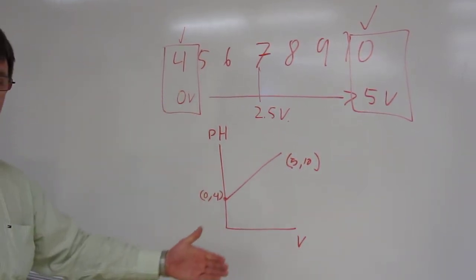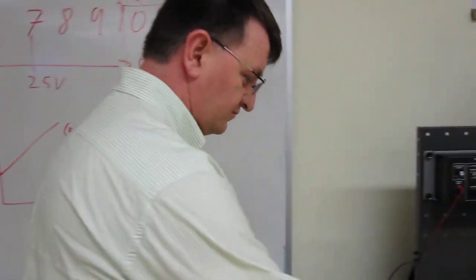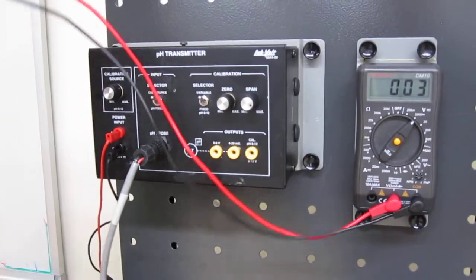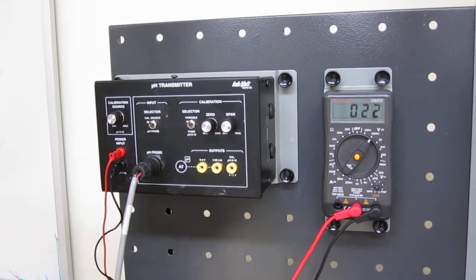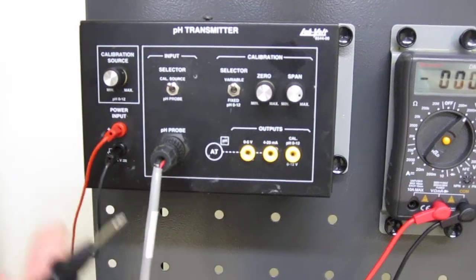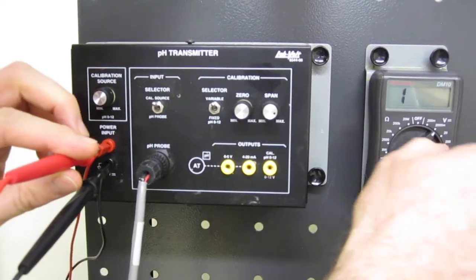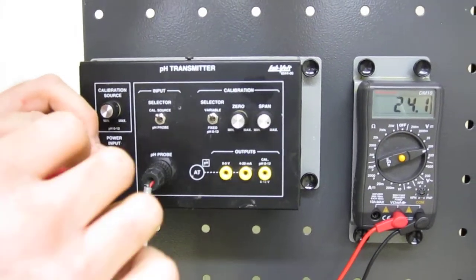We can do all the math, but we're going to do it directly with a multimeter. The first thing we need to do is connect the pH transmitter to a 24-volt source. Let's test if we have 24 volts here. Yes, I have 24 volts.